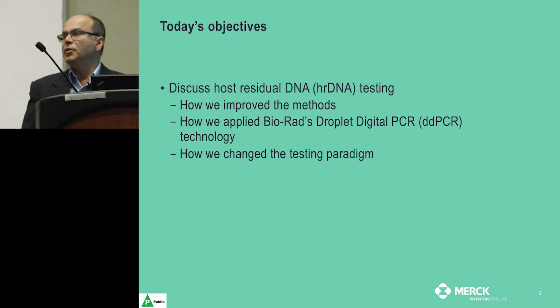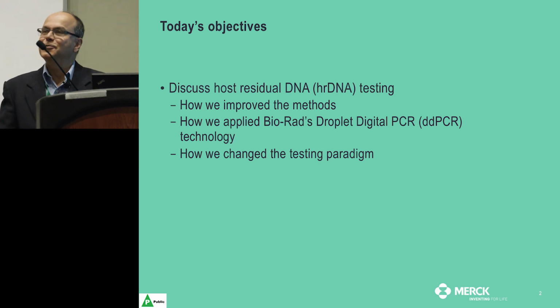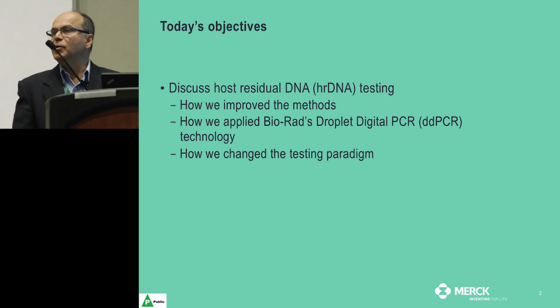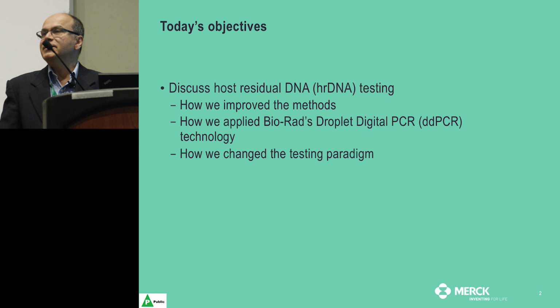In biologics, we are talking about injectable drugs, and nobody is interested in getting injection of host DNA. So today, we're going to discuss the method, the improved methods, how we use the Bio-Rad's Droplet digital PCR technology, and how we change the testing paradigm.